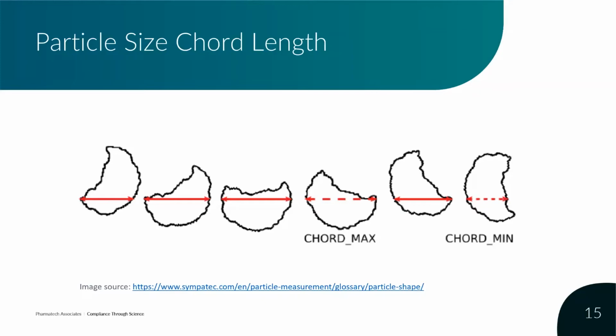Also, porosity of the tablet. Porosity measurements have been shown to be very helpful for developing a model for dissolution real-time release testing. Several products have been approved that use this modeling instead of relying on manual dissolution testing. I'm pretty sure, I believe, all of these products have been immediate release, but research is continually progressing in this area.